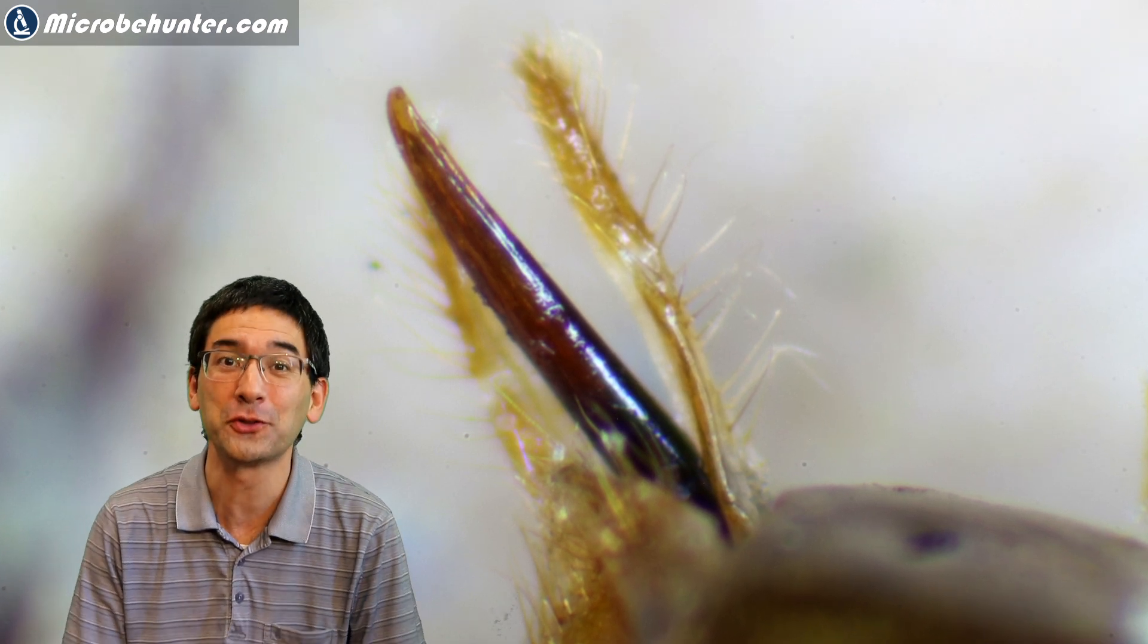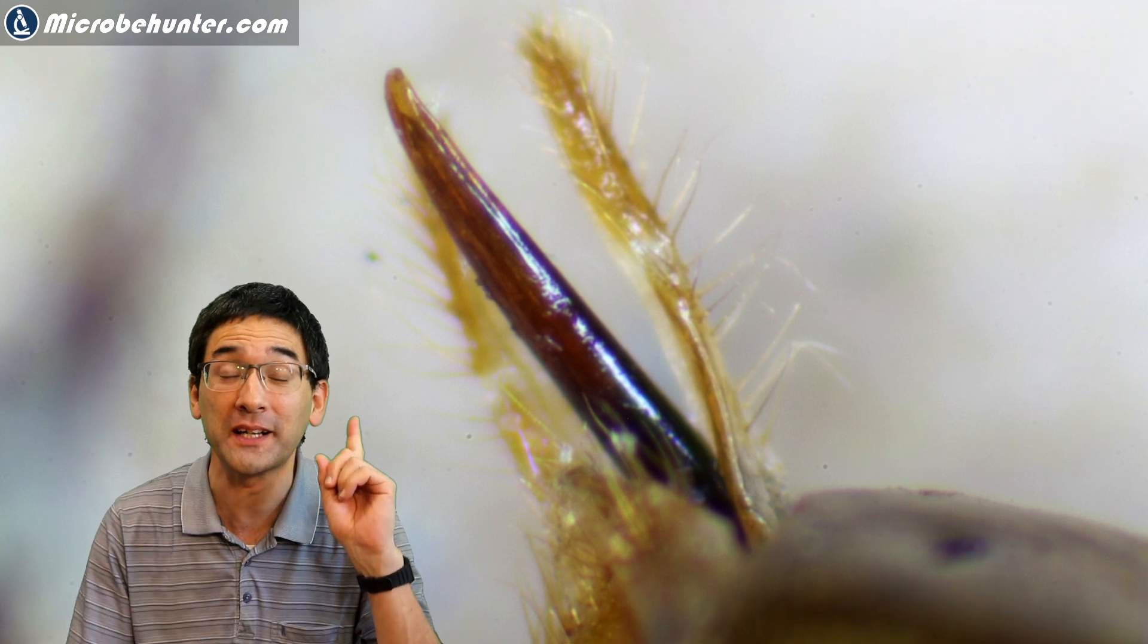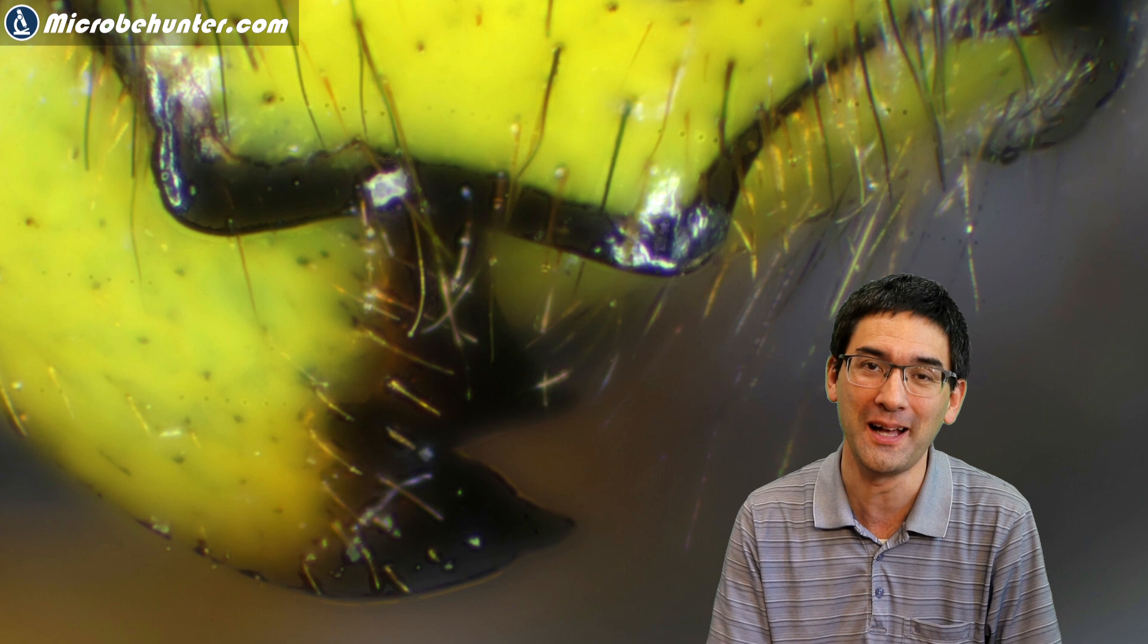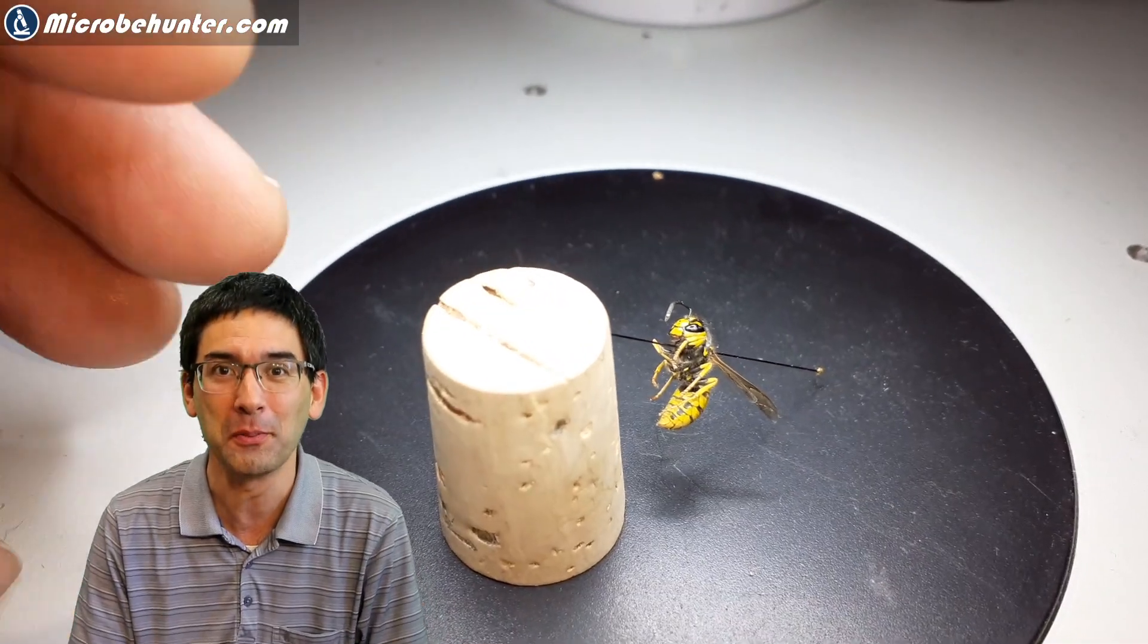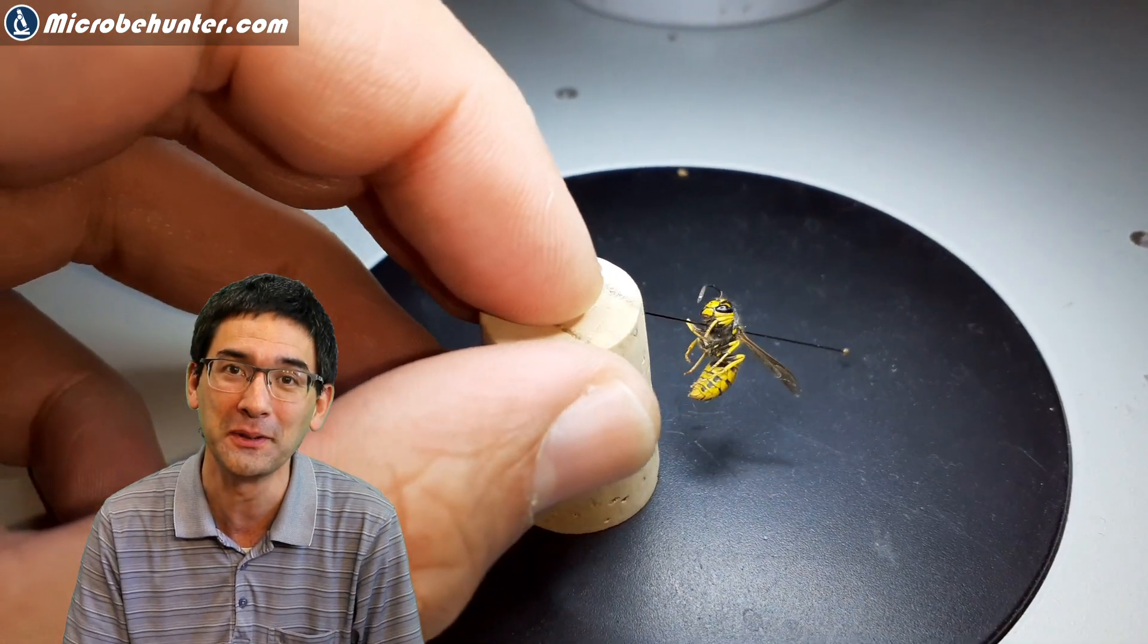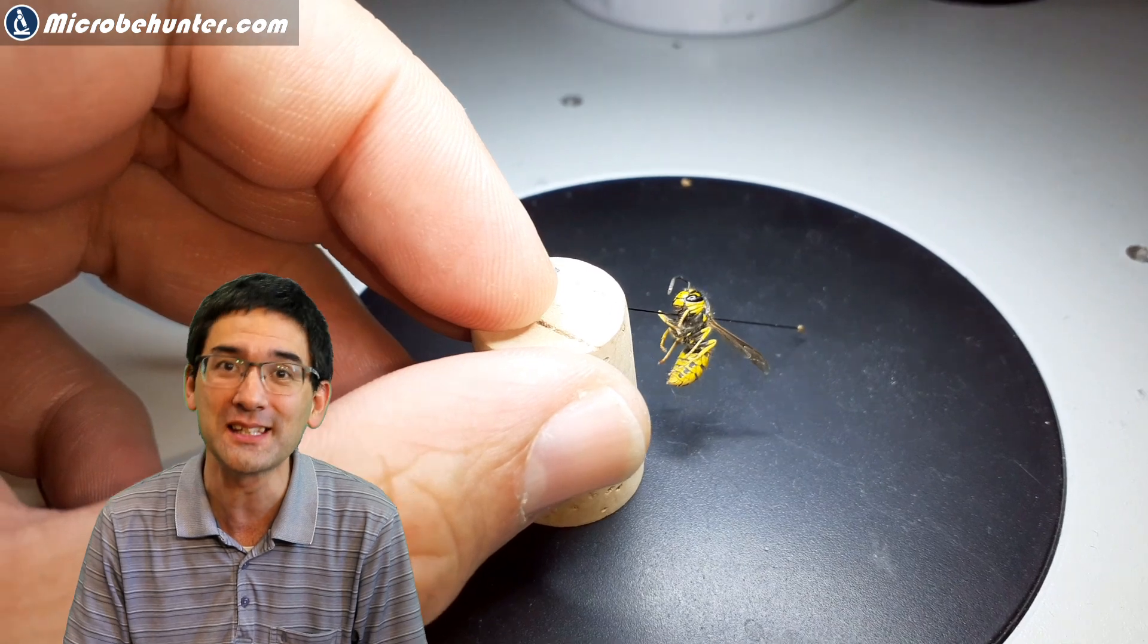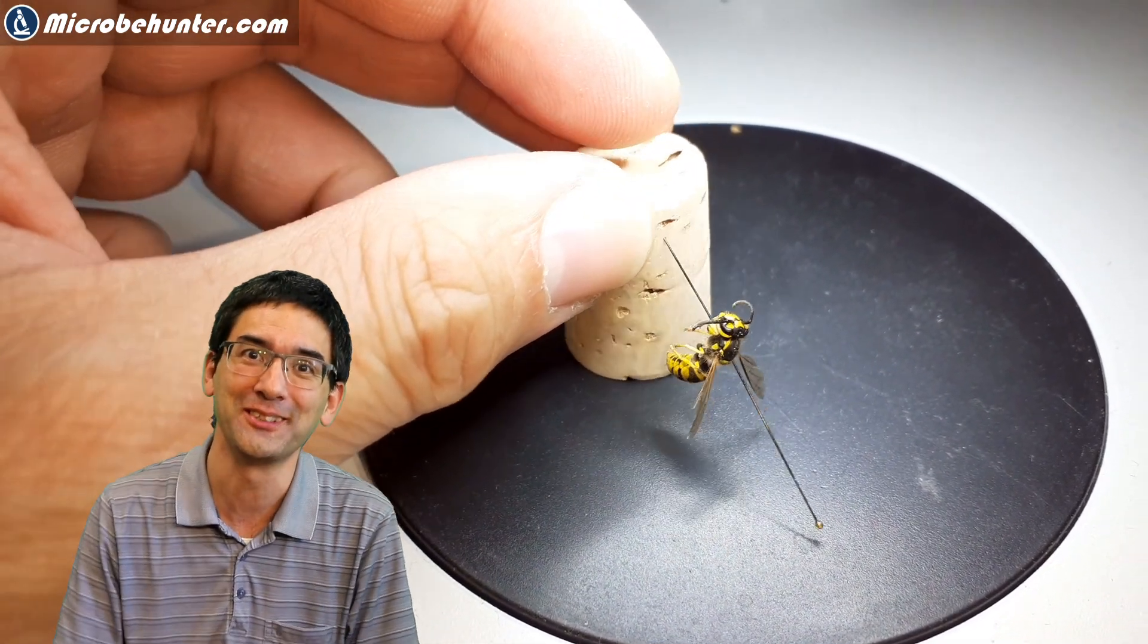Hi, hello, welcome. MicrobeHunter here and today I'm going to put a wasp under the microscope. As a matter of fact, what you see behind me is the stinger of a wasp and I'm also going to show you how I dealt with the wasp problem that I have here in my apartment because some of the wasps actually started to build a nest inside the wall. Stay tuned and let's get started.